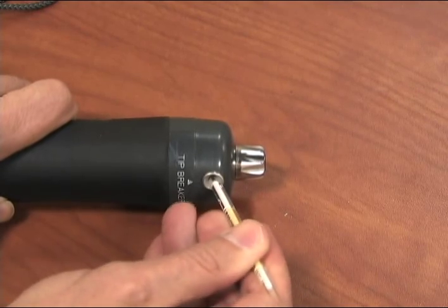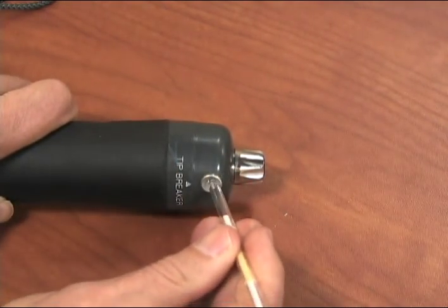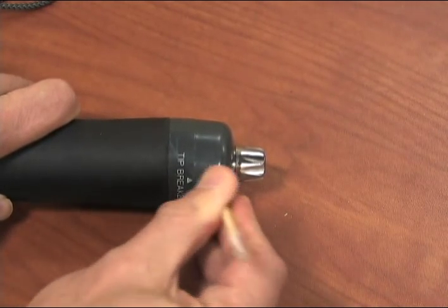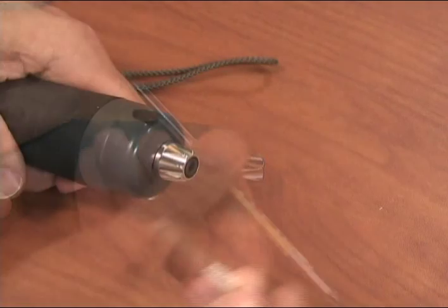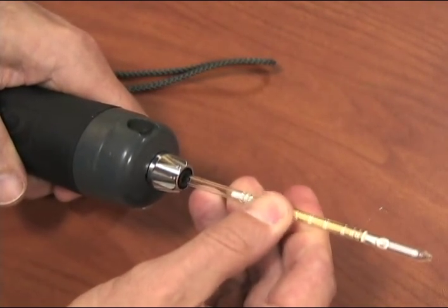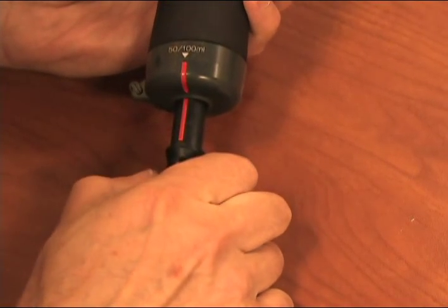To get started, insert each end of a tube into the tip breaker located at the front end of the piston pump. Score and break off both ends of the tube, then insert the tube securely into the pump inlet with the arrow on the tube pointing toward the pump.